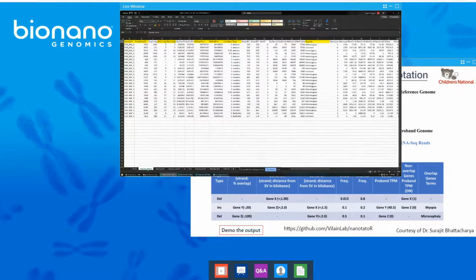So here, when the variants are classified, they're put into different categories by inheritance. If you don't have any parental samples available, we can put these in the same categories, for example insertions, deletions, inversions, and translocations. Or if you have a control sample, where only one of the parents, for example, is available, then we'll have shared and not shared variations with either of the parents. Or in case of tumor, whether it's present in the tumor sample or not present.